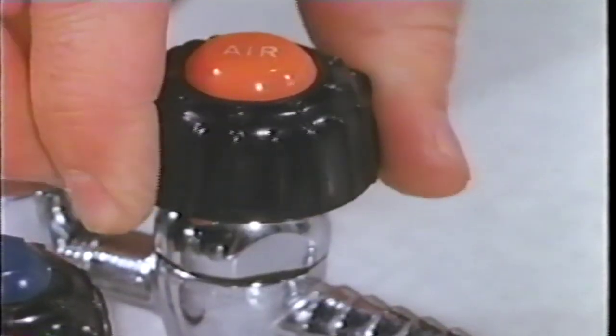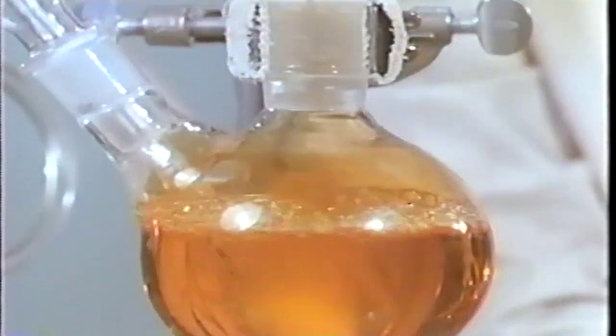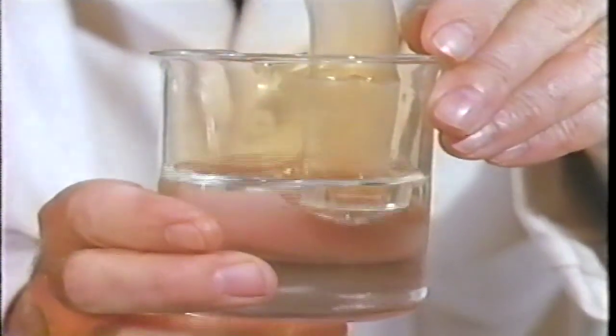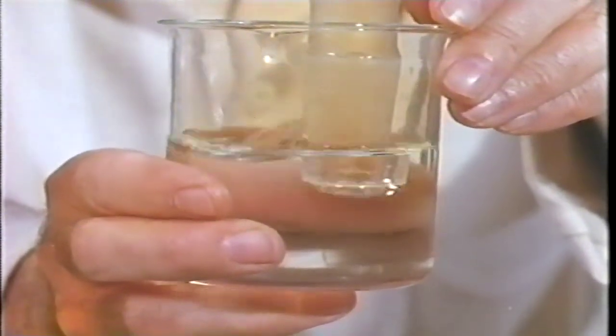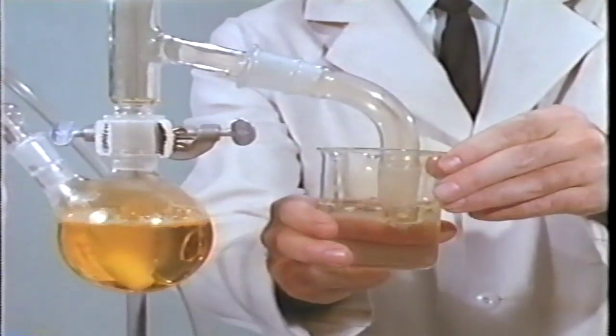The compressed air sweeps the bromine out of the solution. If we try to collect the bromine in a beaker of water, you can see that very little of the bromine dissolves.